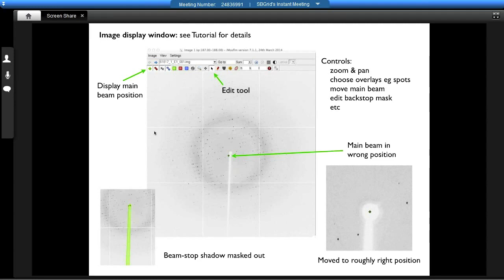Clearly this will not work, but if you click in the first range, edit the first one, it'll automatically fill in all the others as consecutive. You don't have to edit the whole list. So if things are going wrong, it's worth checking some of these things. I've tried to put a few slides in here of what can go wrong, of things I've seen go wrong. People are endlessly inventive at finding new ways of making it go wrong.